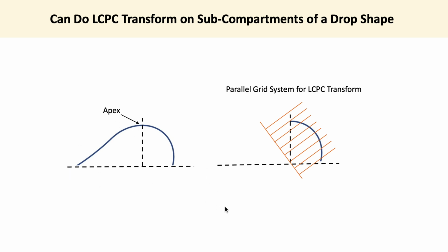Now for drop shape analysis of liquids that are not homogeneous, that is, you have particles inside, or you have nanobots that can be programmed to swim towards one end, you can then measure just particular compartments of the drop shape to test the property of that liquid in homogeneous and non-homogeneous circumstances.